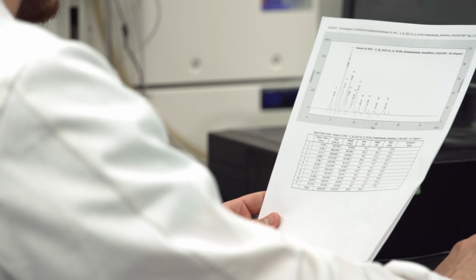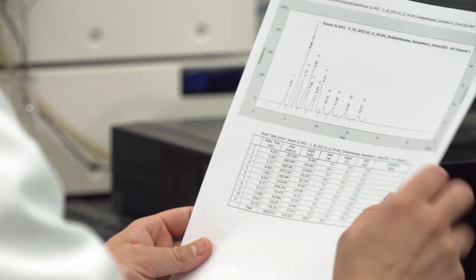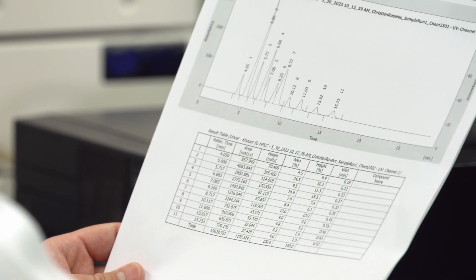The post-lab reports will require you to compare chromatographic data, stating which data gave you the best results and why.